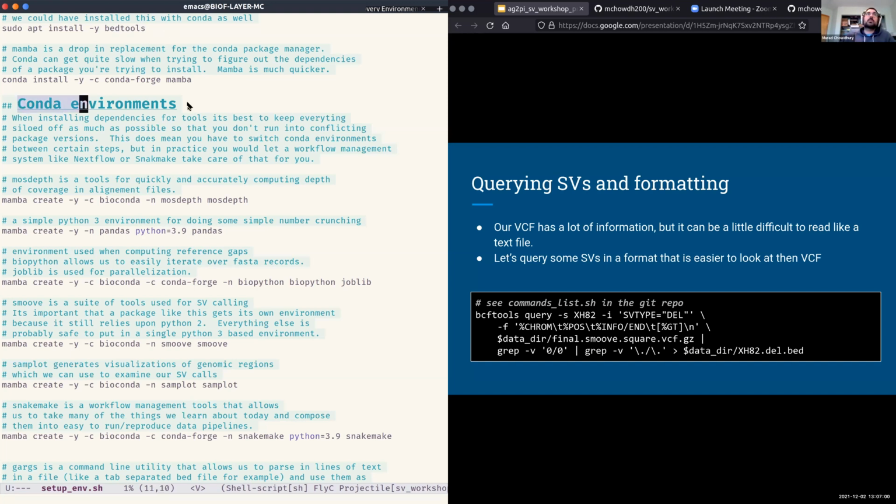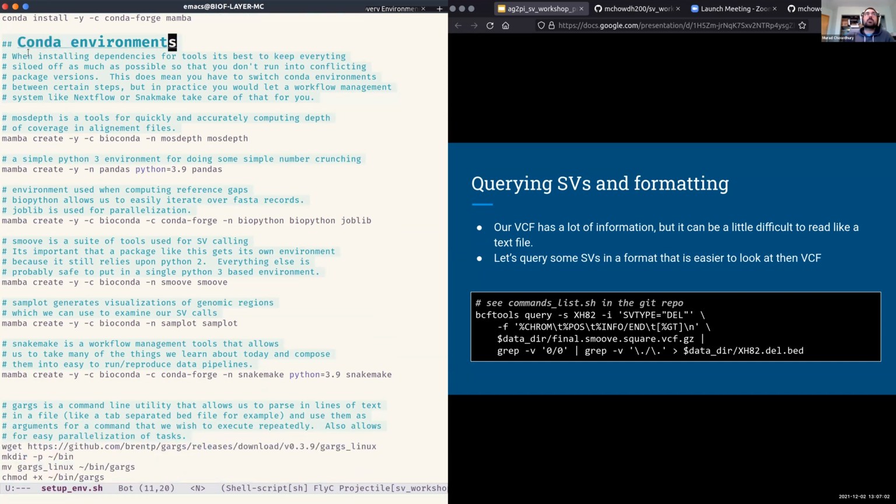Essentially, normally when you're doing individual steps, you create these virtual environments so that you have very small siloed-off environments, so that the dependencies you're using aren't interacting with one another. In the context of this demonstration, having a million small environments can be a little bit cumbersome, at least for demonstration purposes. But oftentimes what you do is you will have some sort of workflow management tool.